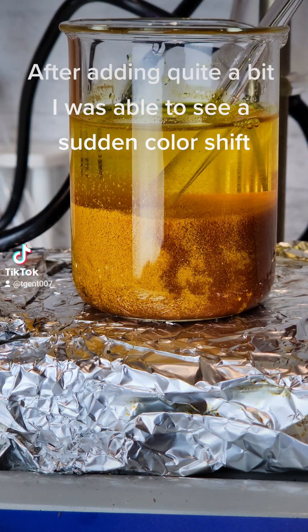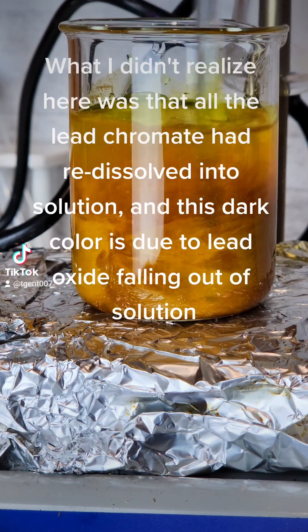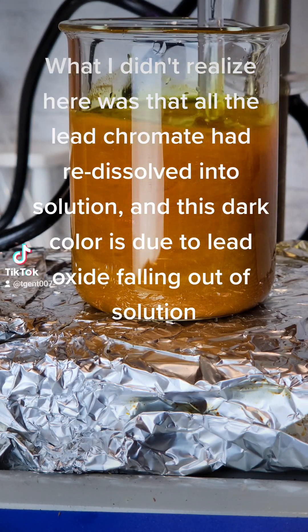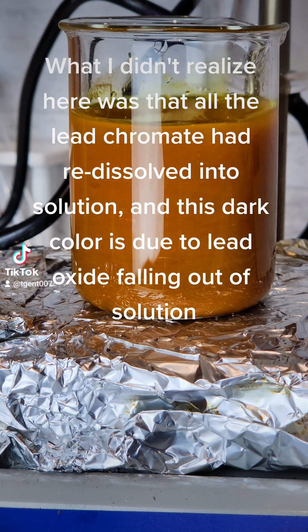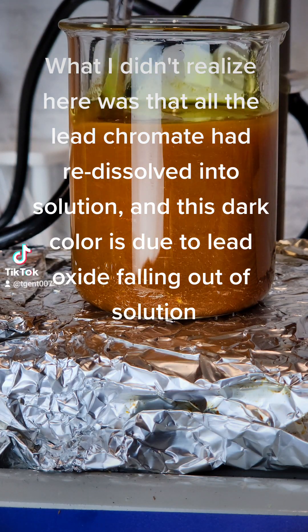After adding quite a bit, I was able to see a sudden color shift. What I didn't realize here was that all the lead chromate had already dissolved into solution, and this dark color is due to lead oxide falling out of solution.